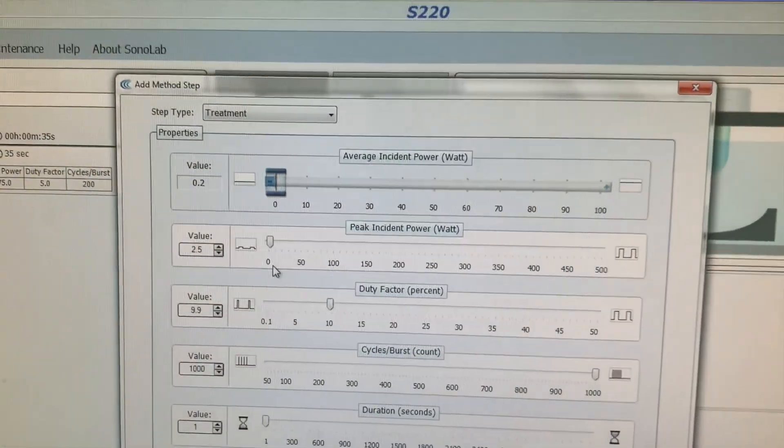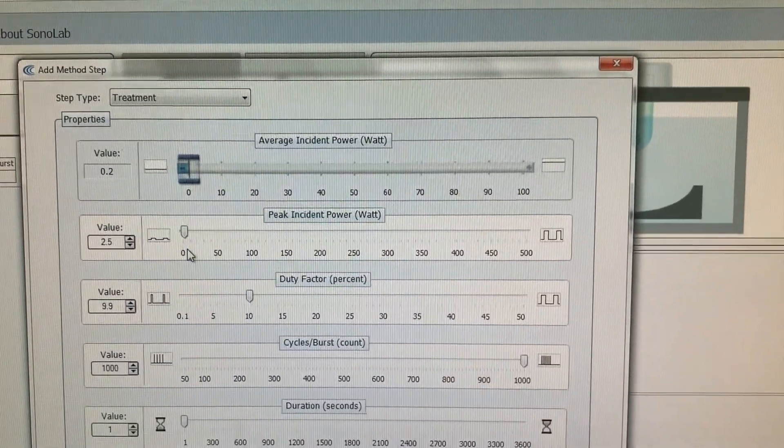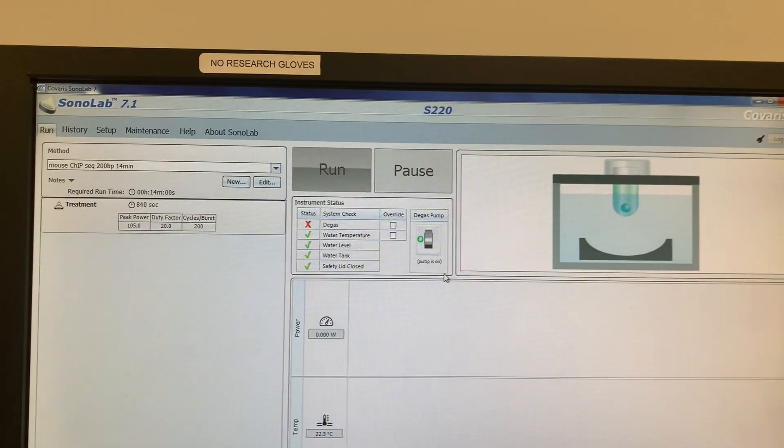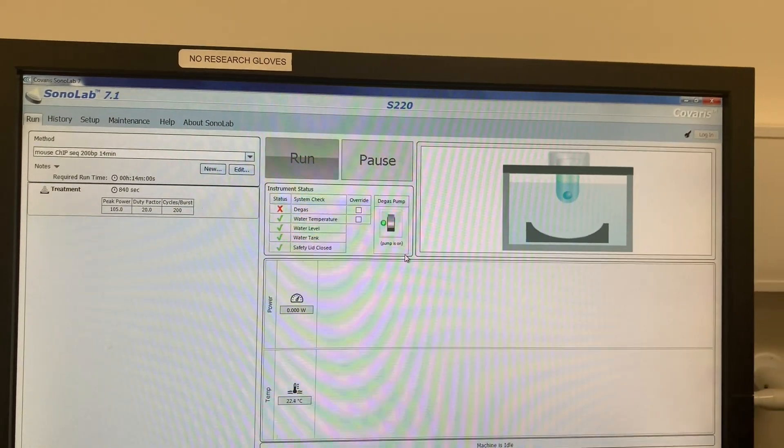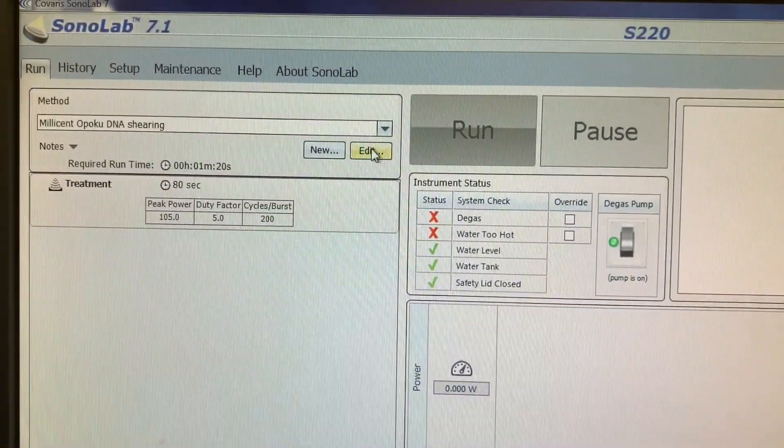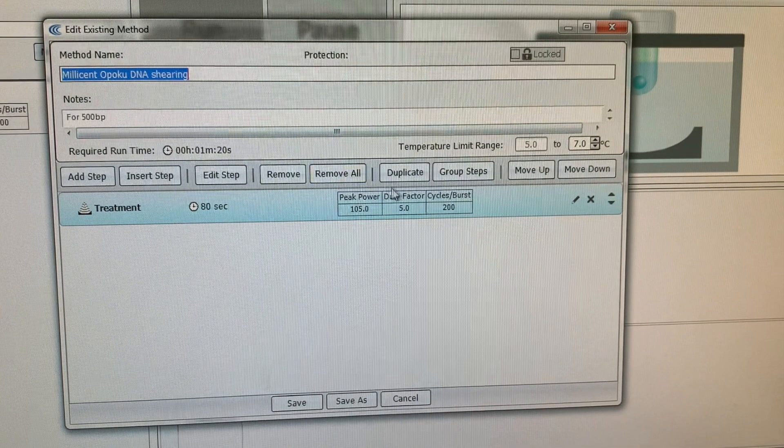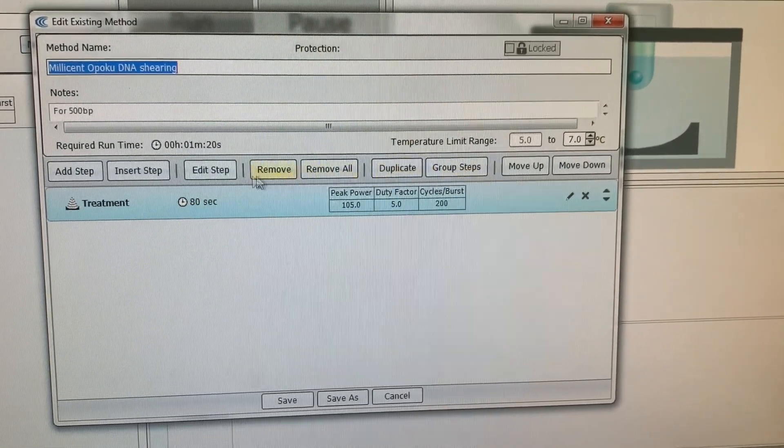The software allows you to input what you need it to do, what you want the instrument to do. The quickest way to do it is to edit an existing program that the software gives you so that you can go ahead and customize it for your particular fragmenting.